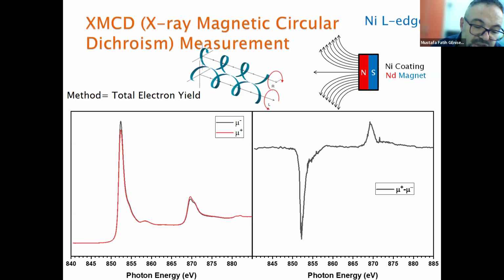The density of states is changing, and the photons have different circular polarization orientation. So in one case, it interacts with the material more. In one rotation, it interacts more with the electrons of similar rotation, and less in the opposite rotation. So that is the idea.